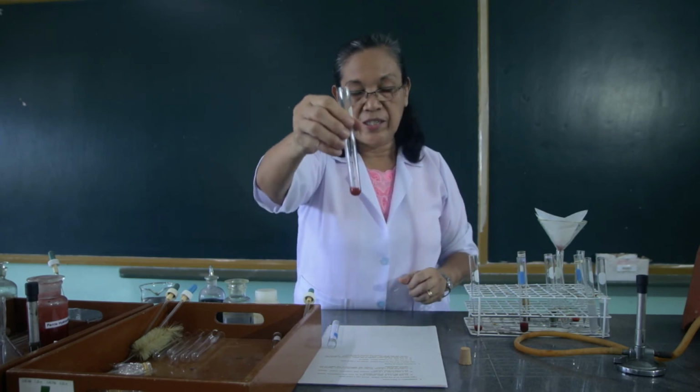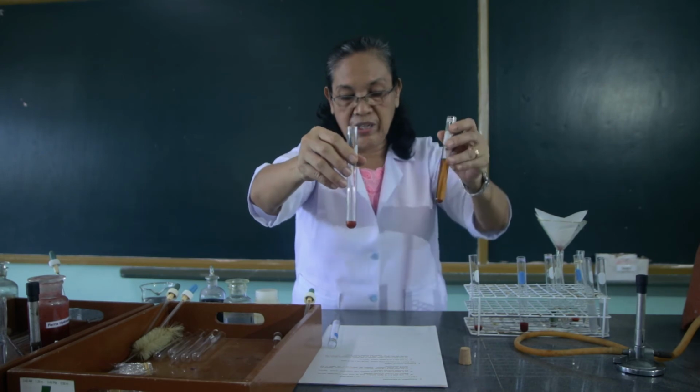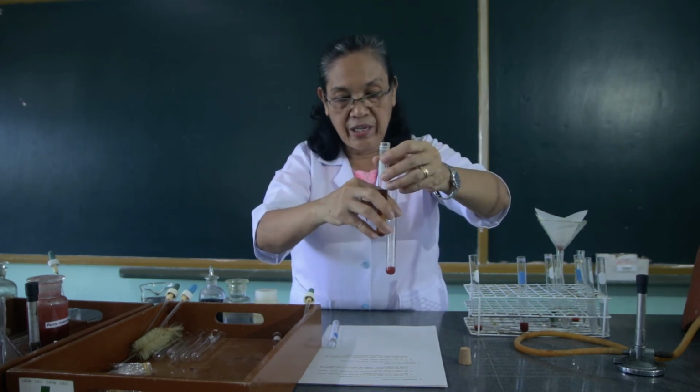Then to the second test tube, we are going to add equal volume of the gelatin solution that we have saved a while ago, and we will shake it vigorously.